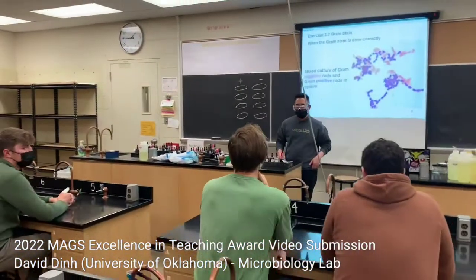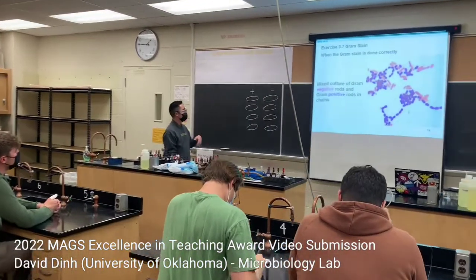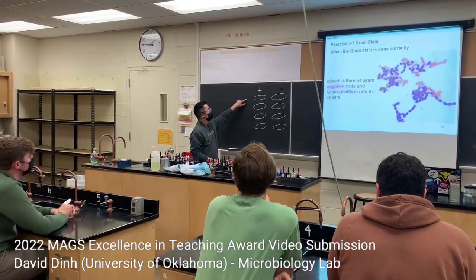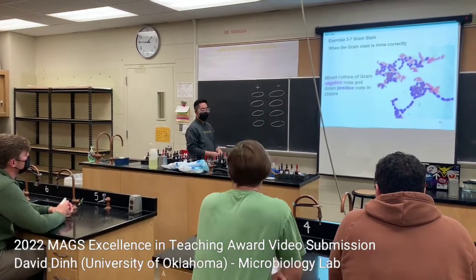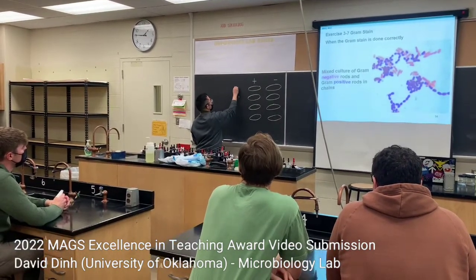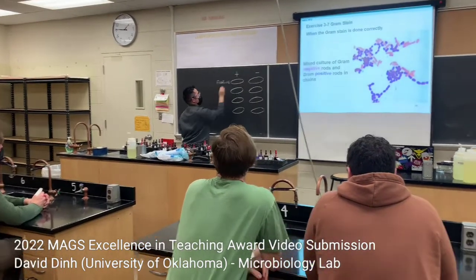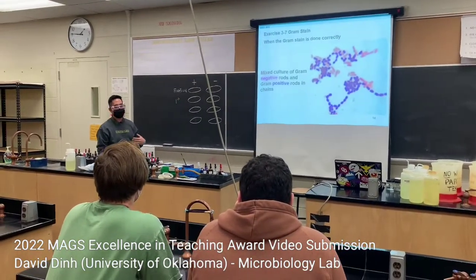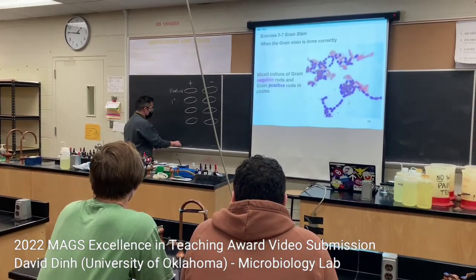Alright, so just to recap for your exam, we're going to go over the steps again so that you know what is actually happening at each step. So what is the first step? If you remember, after you do your smear, you do the primary stain. But first, the fixation. At fixation, what is the color of your organism for both gram-negative and gram-positive? Transparent. So I'll just keep it white.